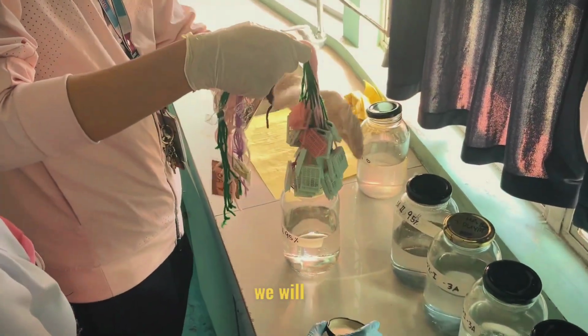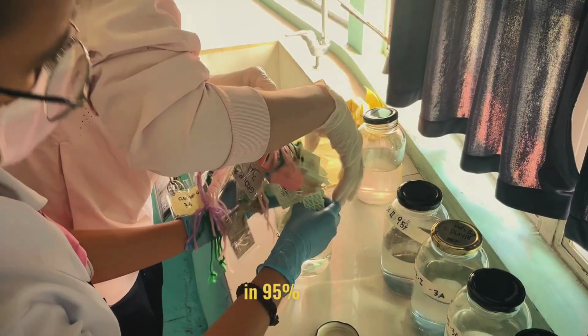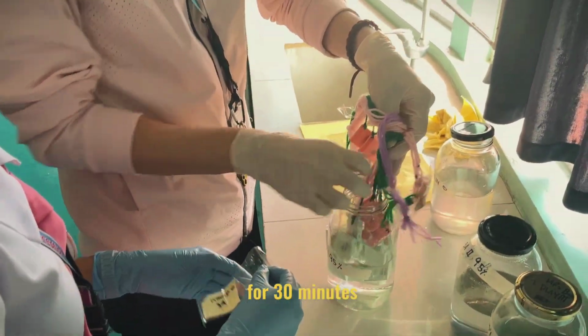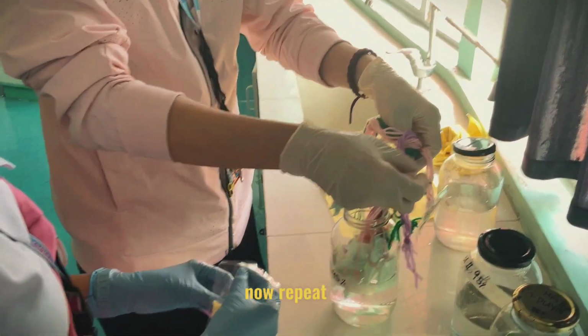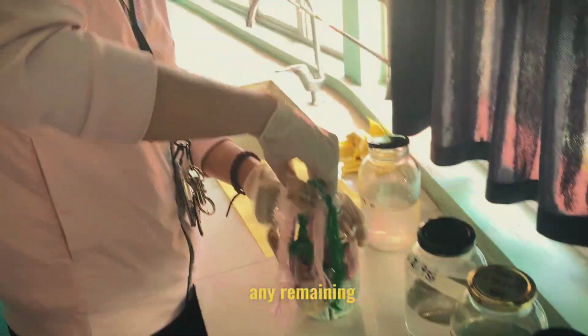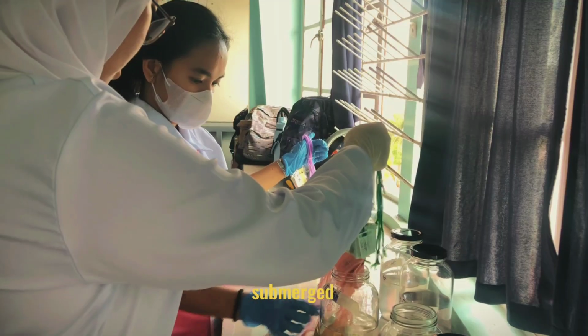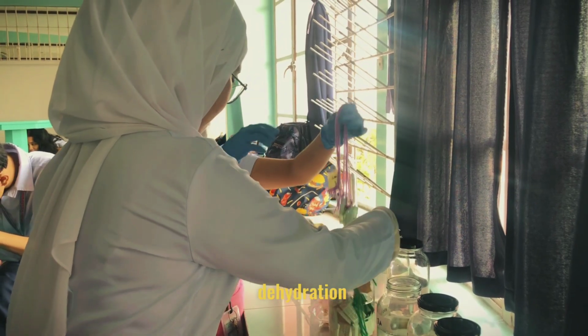After fixation, we will begin the dehydration process. Place the tissue in 95% ethanol for 30 minutes. Now, repeat this process for another 30 minutes to ensure that any remaining moisture is thoroughly removed from the tissue. Now, the tissues will be submerged in absolute alcohol for 30 minutes to complete dehydration.